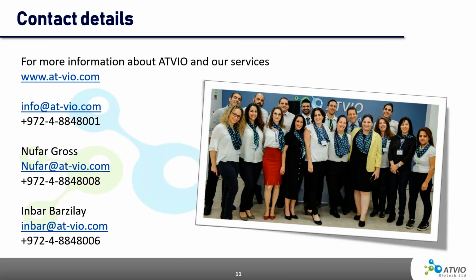Okay, thank you. We've got a couple more. So we talked about clean room use. However, this is very expensive and may bring cost of manufacturing up a lot. What about switching to isolators in Class C or D background environments? Okay, this is a very good question, because there is a lot of movement going into isolators. This is really process dependent. There are some processes that we can use isolators for, but when handling very large equipment like cell stacks or 40-layer cell factories, this is something that we cannot do right now in isolators, or we need to build very big ones. So again, it really depends on the process you have.